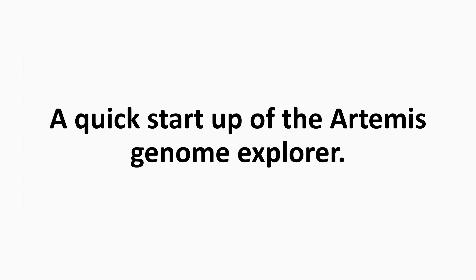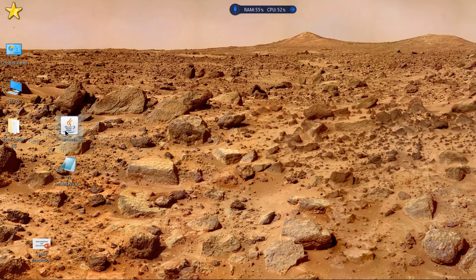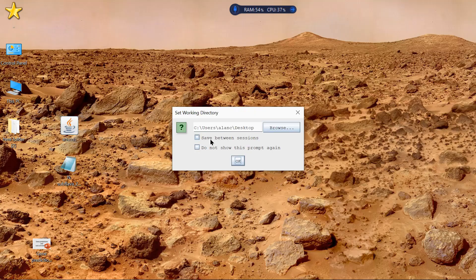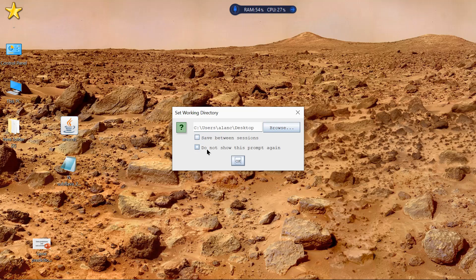I was just going to do a quick start-up of Artemis Genome Explorer. To open Artemis, you get a few options here, so you can save between sessions, as well as set a working directory. I'm just going to leave this as it is.